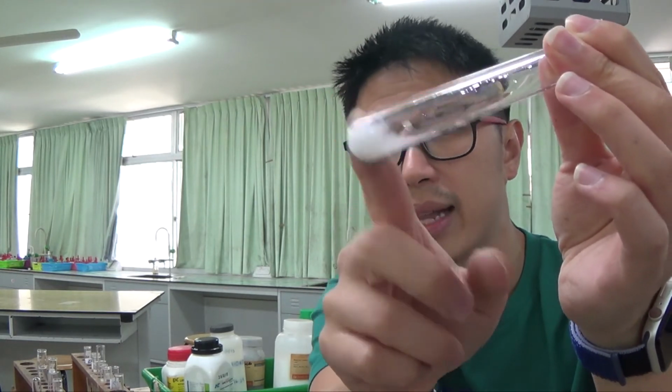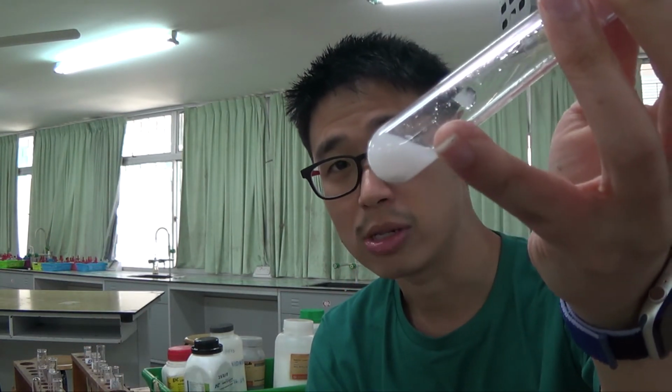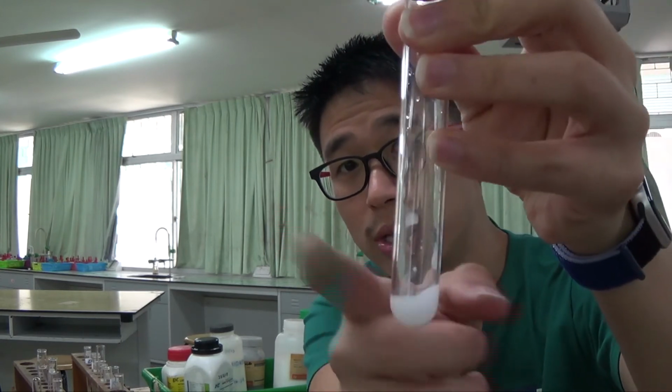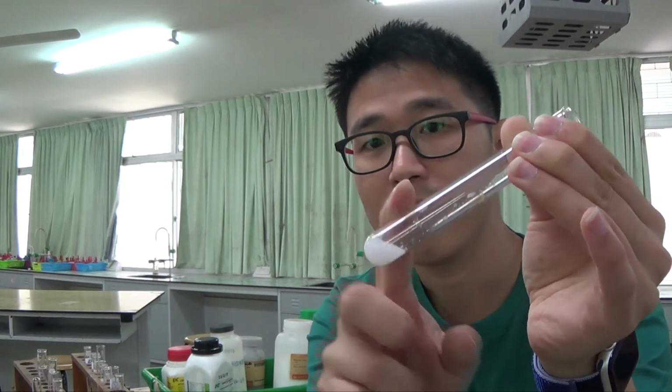That's why you need to add excess ammonia to this. But my ammonia is running low, so I don't want to add excess ammonia. But if you are an A-level student watching this tutorial video, you know that to determine whether it's silver chloride or silver bromide, you need to add excess aqueous ammonia. If it dissolves, then it's chloride that was present.